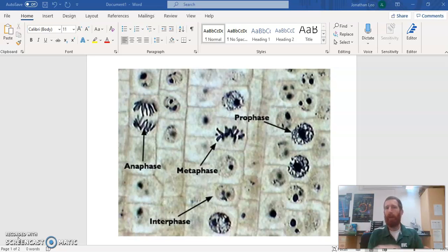Now, the nucleus in a plant cell and in an animal cell are both round. Right, so find my mouse right here. Hopefully the cursor is highlighted on the video. But you can see the faint outline of the cell right here, and here's another cell, and here's another cell right here. Sometimes there'll be cells overlapping other cells, so it'll be a little bit different, but you can fight through the difficulty and you can get that. So if these boxes are cells, then these round things right here must be the nucleus. Okay, so all of these things are nuclei, and the slides that we're going to be looking at have been stained so that the DNA is highlighted. So all of these dark lines or blotches or squiggles, all of those things are DNA.